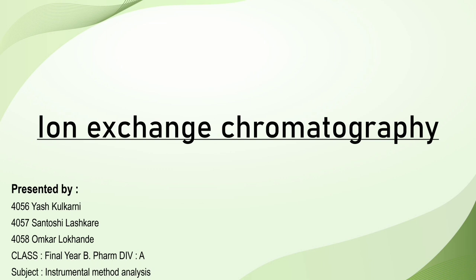Today we discuss ion exchange chromatography, presented by Yash Kulkarni, Santoshi Lashkare, Omkar Lokhande from final year B Pharm Division A. Subject: Instrumental Method of Analysis. Today we discuss ion exchange chromatography: introduction, classification, methodology and application.